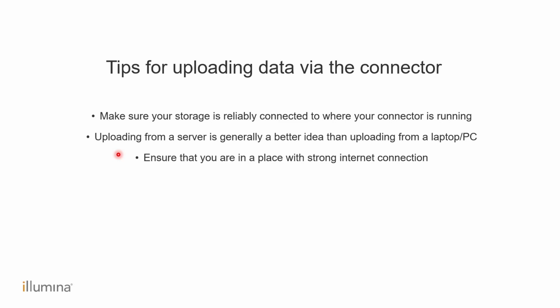Third, transfer speed largely depends on your internet connection as well as how many small files you're uploading. Ensure that you are in a place with strong internet connection. And finally, don't copy data in your upload folder while the connector is still uploading.